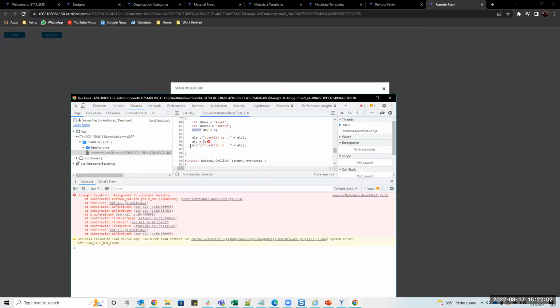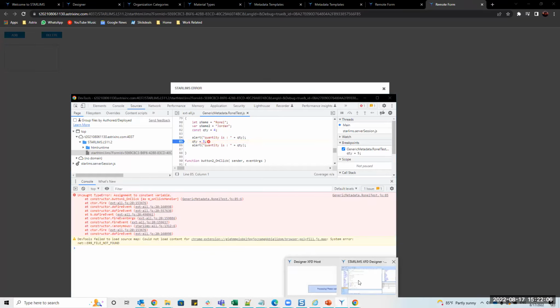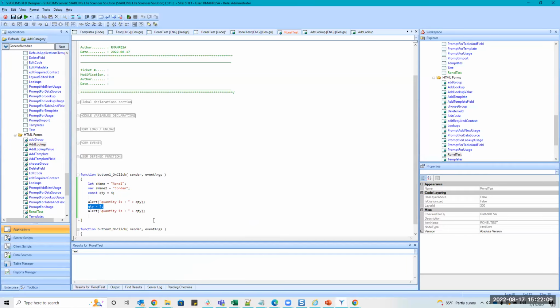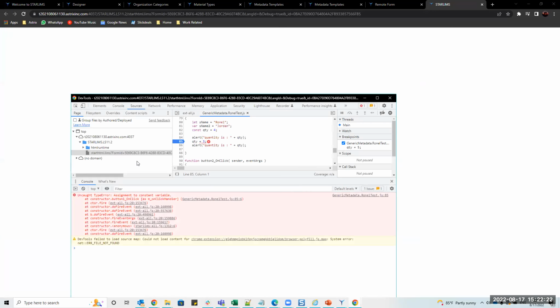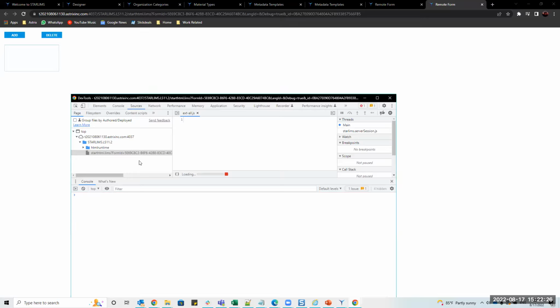Okay, so that's an error. I see that. I'm like, no, what are you doing? You can't do this. Let me make it a... That window? The Chrome debugger? Yeah. Did that just pop up automatically, or did you? F12. You have to hit F12 on the keyboard. Okay, thank you. Yep. So quantity is 4, quantity is 5. It's happy now. Boom.